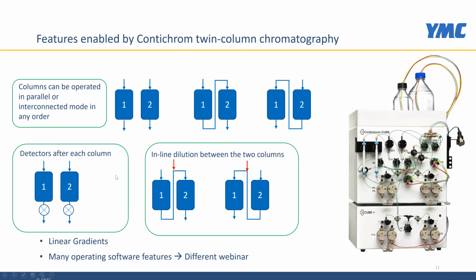And on its way into the second column, the stream is inline diluted, or has a connection to the inline dilution pump 2 here. Now this inline dilution pump is currently not active. You can see the flow rate here; it's shown 0, so it's not running. But if it was running, you could see it here.